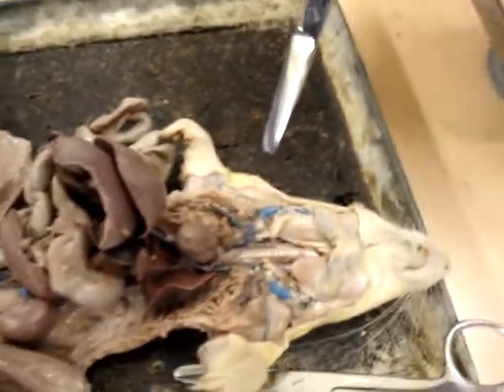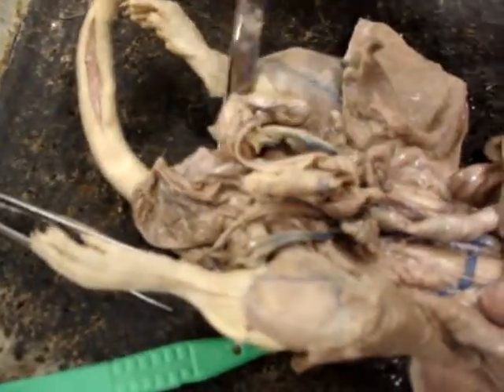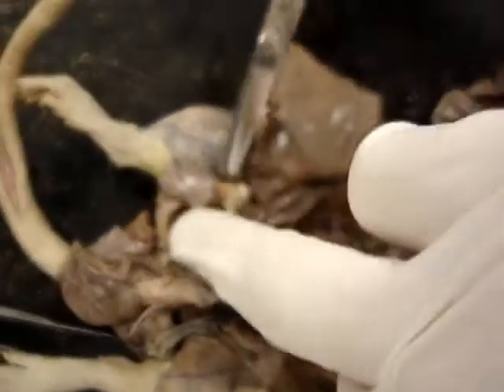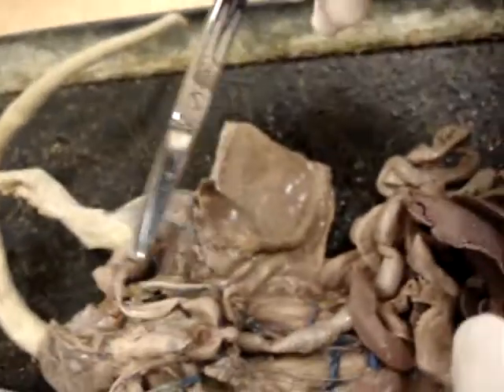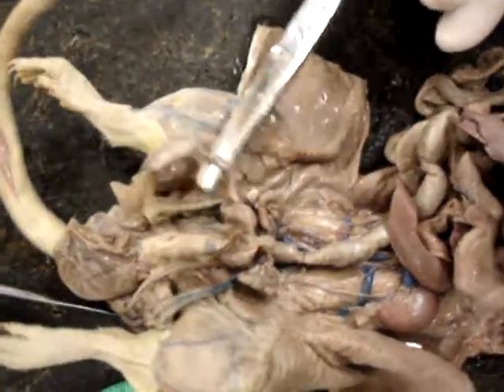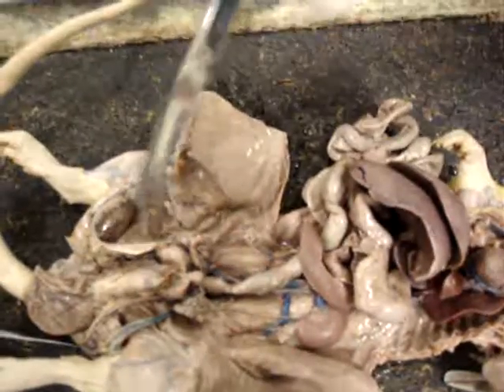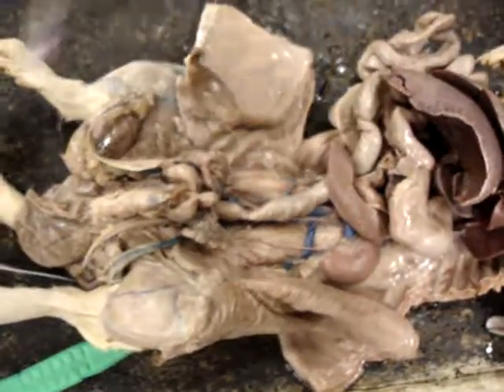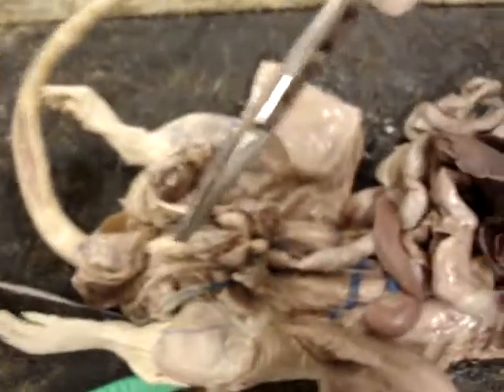Now the reproductive system in males. We have the testes — those are the testes. The epididymis is just right below or right above the testes — that's the epididymis. The vas deferens goes around the testes. Those are the prostate glands. The scrotum is the sac. And the penis would be right here at the pointer.